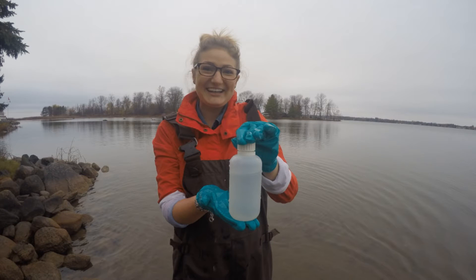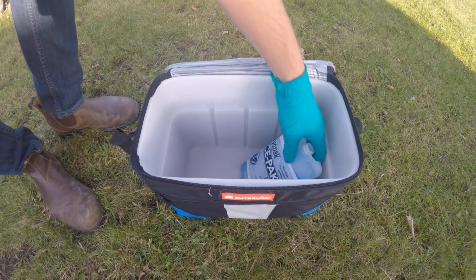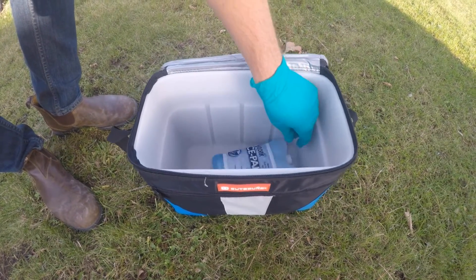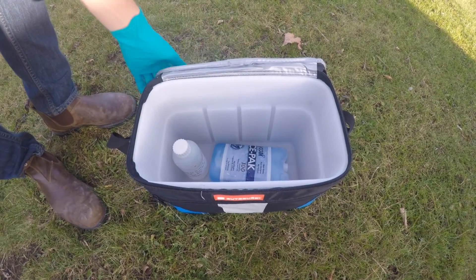Fill the bottle to about 90% full. If you overfill the bottle, flip out the excess by flicking the wrist — do not pour it out. Once you have collected your sample, it must stay cool, approximately 5 degrees. Place the sample in a cooler with an ice pack to maintain this optimum temperature.